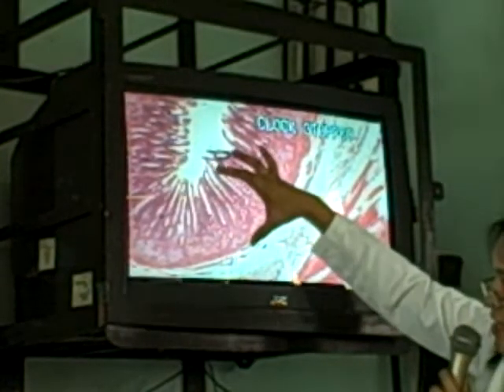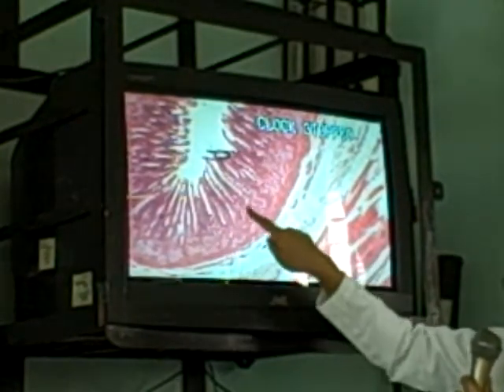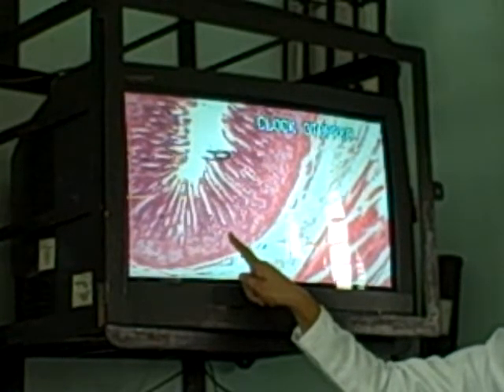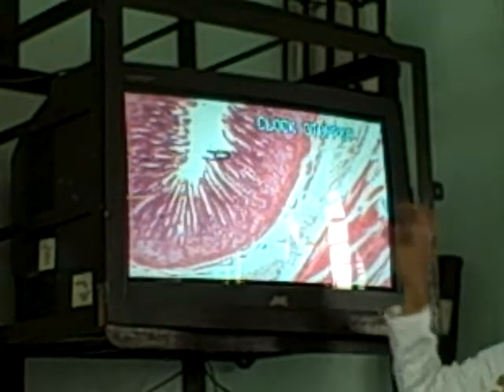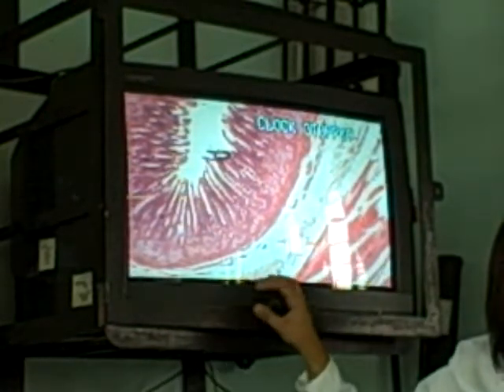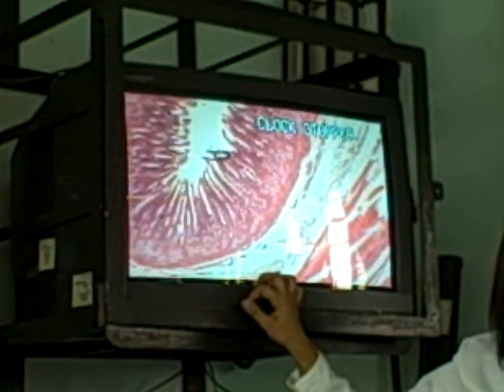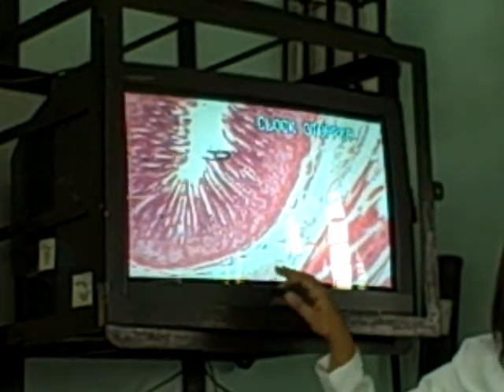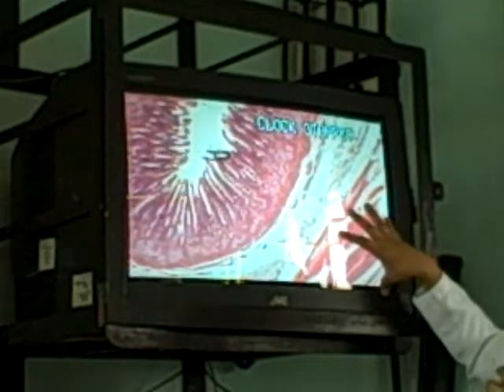Theoretically, you have the gland in the lamina propria, which is present. This is the mucosa, wherein the lamina propria contains glands. What type of glands? Intestinal glands, or crypts of Lieberkuhn. Then followed by the submucosa. For duodenum, you should have gland here, which is called, for submucosa? Brunner's gland, remember? And then followed by the tunica muscularis.